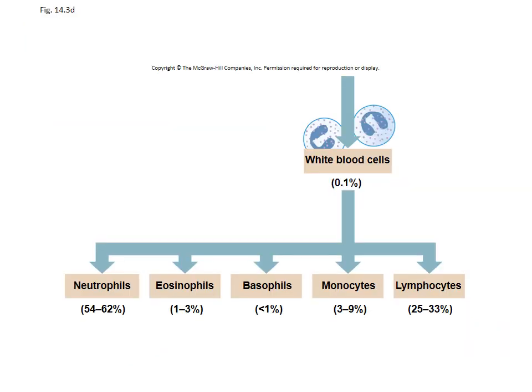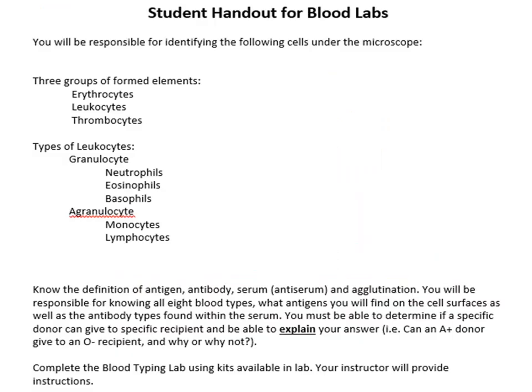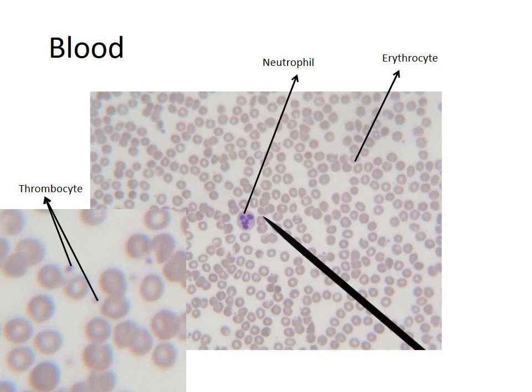So the white blood cells, as it says, the leukocytes are divided up. This gives a number, which we will come back to, a percentage. In lecture, we're going to look at this. When a healthcare provider looks at these, this is called a differential. And if any of these percentages is out of its range, it'll give the clinician an idea of what's going on. Now, the first one we're going to look at up here is the neutrophil. The neutrophil is the most common of all of the leukocytes, of all the white blood cells.